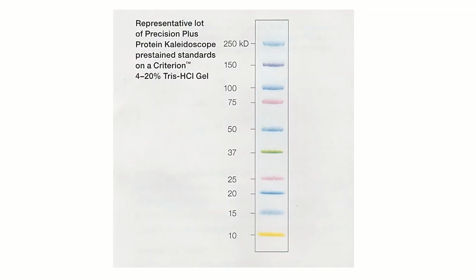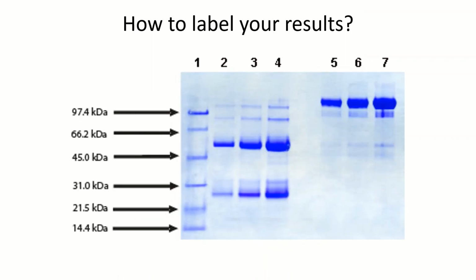So this is our standard. The brand is Precision Plus Protein Kaleidoscope. And we will be able to compare the result later on with this particular chart in terms of the sizes of the proteins. So here's a perfectly done electrophoresis.